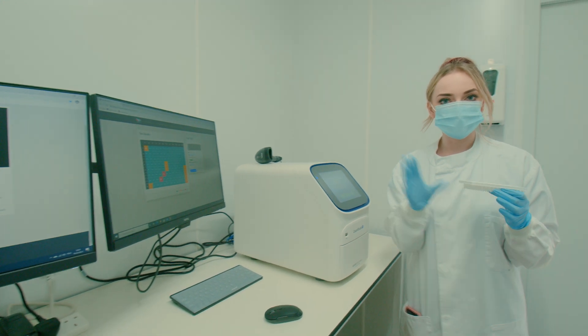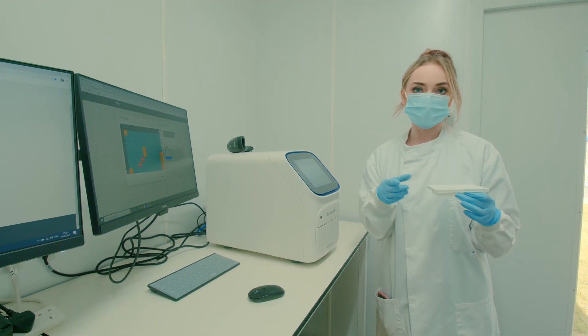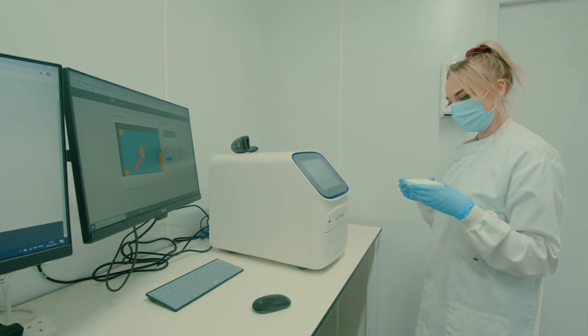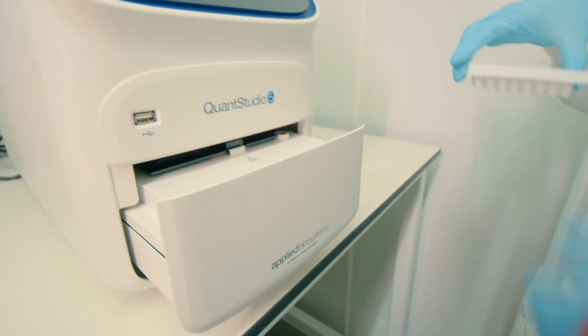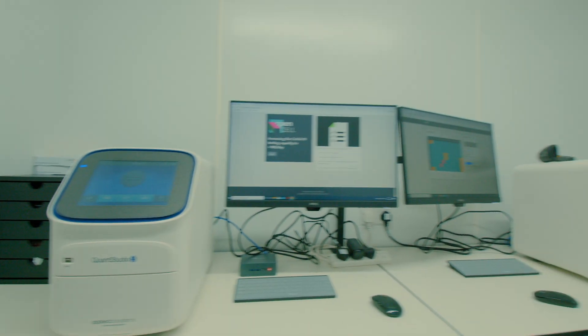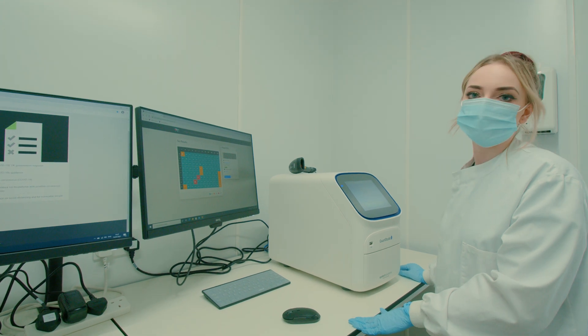In this stage, what we want to achieve is to convert the viral RNA into DNA so that it can be detected by our PCR machine. We provide the building blocks for the first stage of this process, and then the machine will do the rest. The machine uses a variety of heat cycles to complete the process.